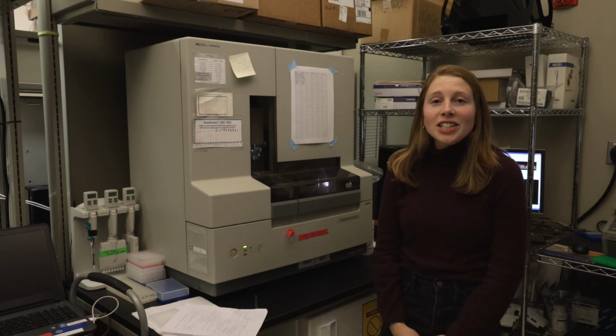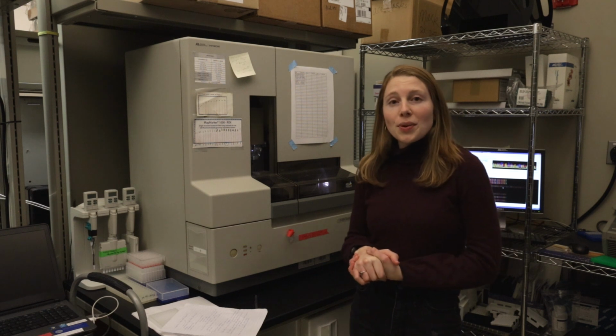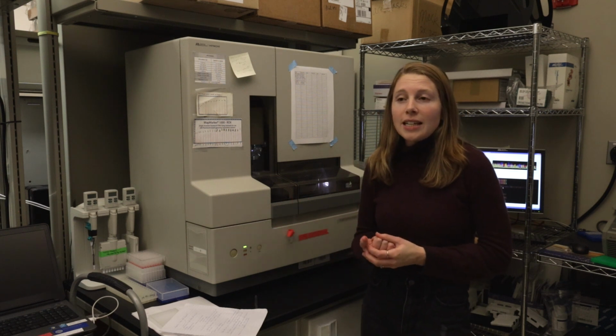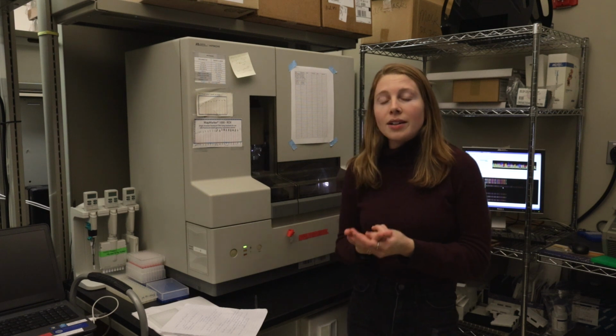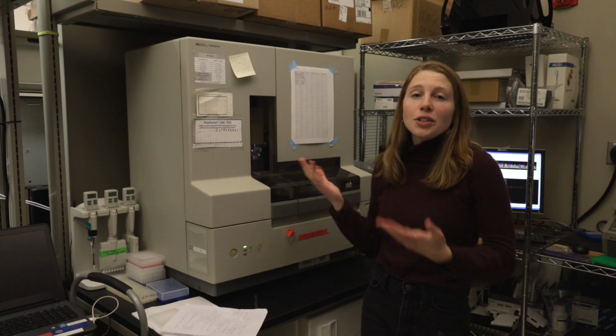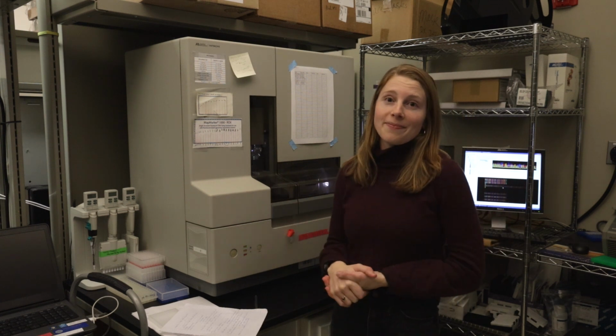So Sanger technology is one of the oldest sequencing technologies, over 50 years old, but we still use it because it's cost effective, it's very accurate, and it's great on shorter DNA fragments. And so that's why it's still used very regularly in genetics labs. It's the workhorse, you might say.